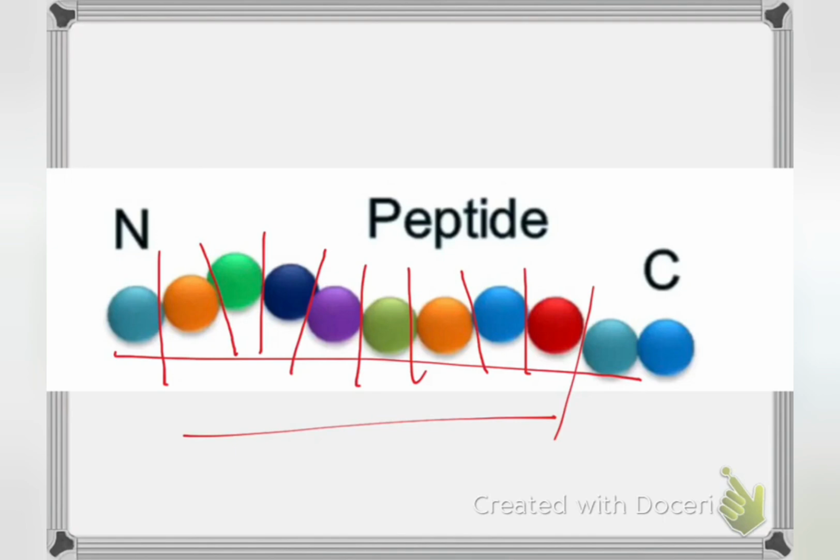This is the Edman degradation method. This method is used for detecting the sequence of amino acids present in a protein or peptide. The N-terminal amino acid is labeled and then cleaved first. It is then treated with acid, then extracted with organic solvents, forming the last compound, phenyl thiohydantoin, which is easily identified by electrophoresis or chromatography. This is the Edman degradation method.